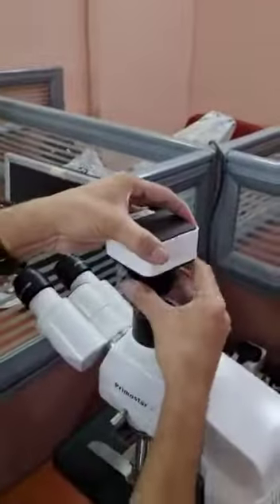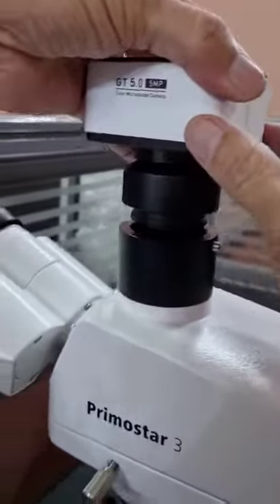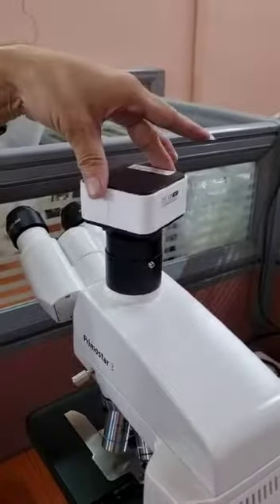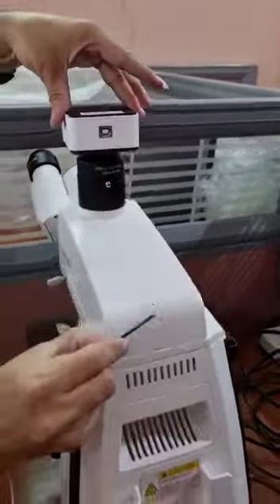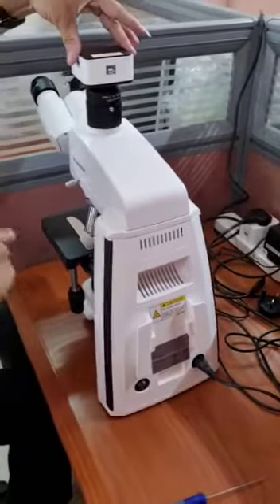Now we come to the trinocular port. Hold the assembly exactly vertical and insert it so the camera goes down into the port. After it goes down, you can see that the camera can be rotated. It is always recommended that the USB cable connection comes at the back, so that the cable will not hinder your operation of the microscope.